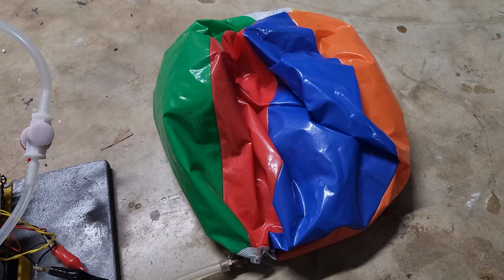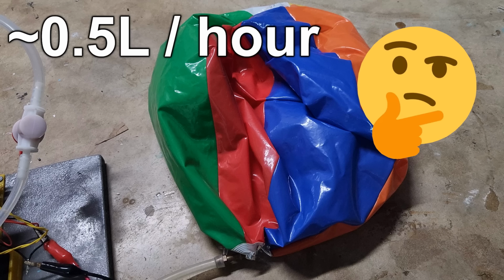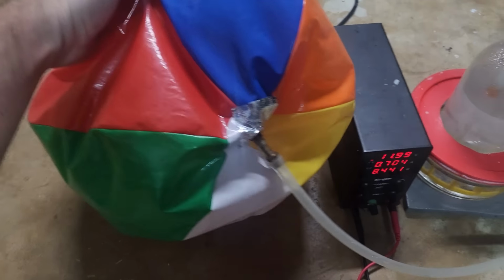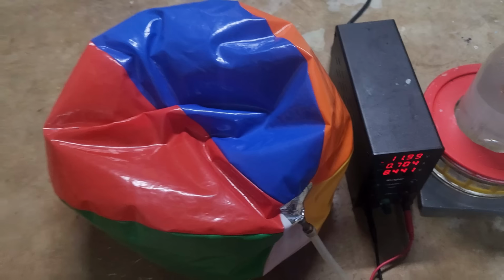The beach ball is about 26 liters fully inflated, and this is less than half inflated, meaning that the average production rate was around half a liter per hour, which is just a little more than half of the 0.94 that I originally predicted. And here's the 48 hours of running. I'd estimate the ball is about 3/4 full, which would be about 19.5 liters or 0.4 liters per hour. This seems like it's way less than it should be.